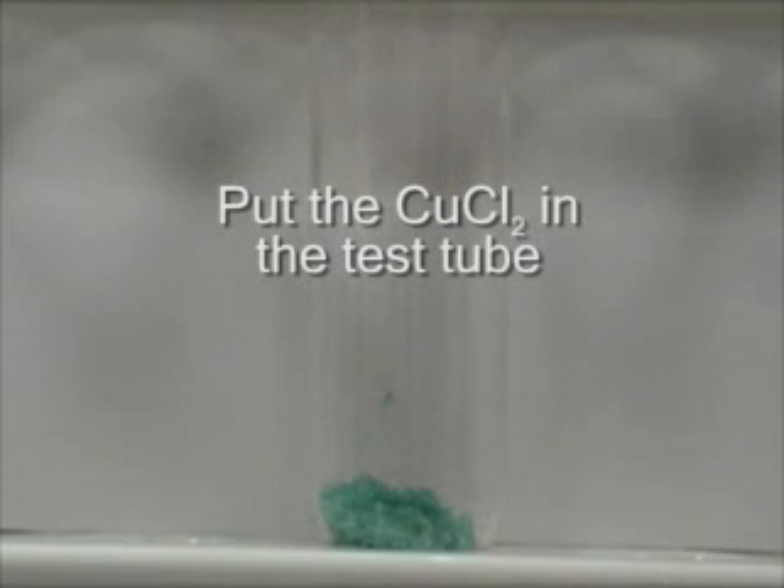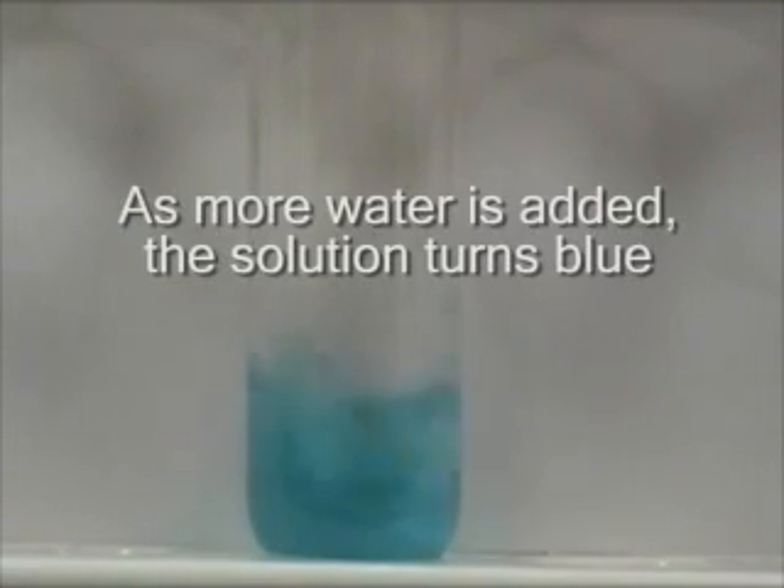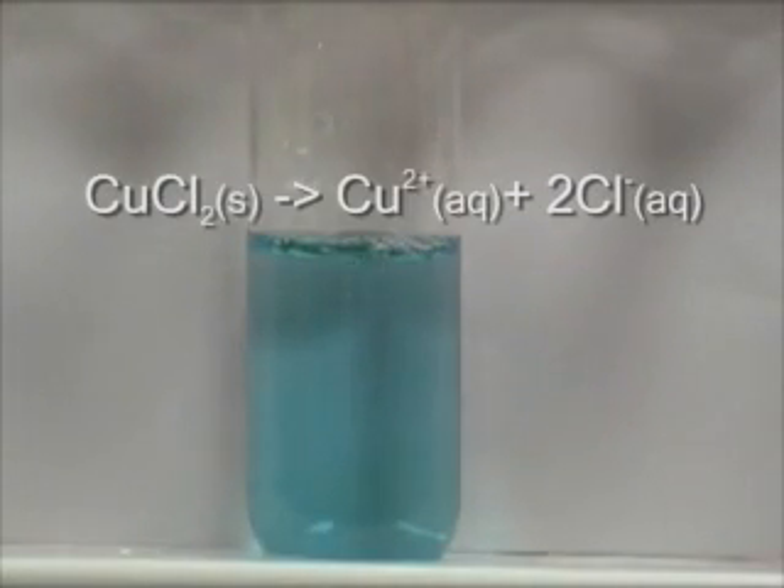Put the CuCl₂ in the test tube and add water. The green color is a complex ion with the central ion of Cu2+, and ligands of Cl- and H₂O. As more water is added, the solution turns blue. This is because the CuCl₂ dissociates in water into Cu2+ and Cl-.